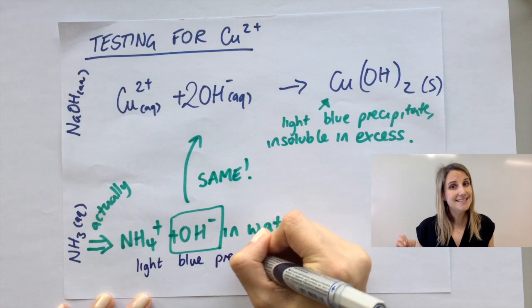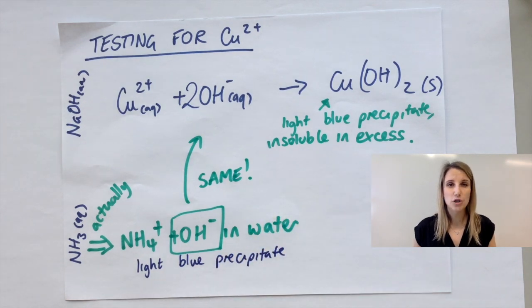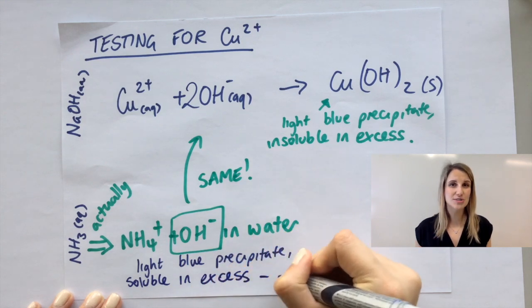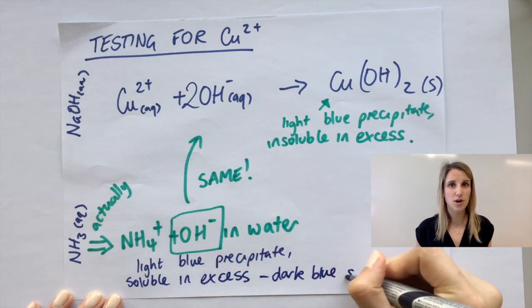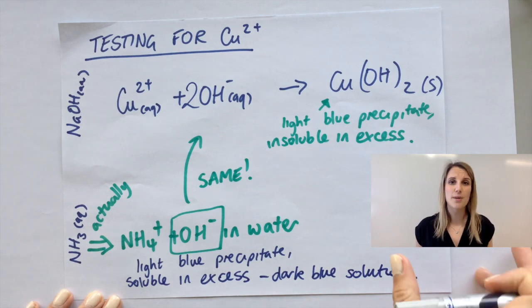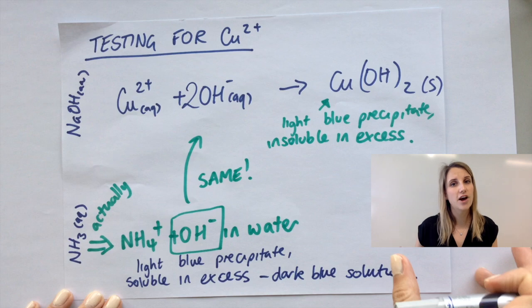Now with the ammonia we did see that it made that dark blue solution when I added a lot of it, and that happens due to something called ligand exchange, which is definitely not in the GCSE and you don't need to worry about the reasons behind. But if you're looking to confirm that it's definitely copper, then this is something that only copper does.